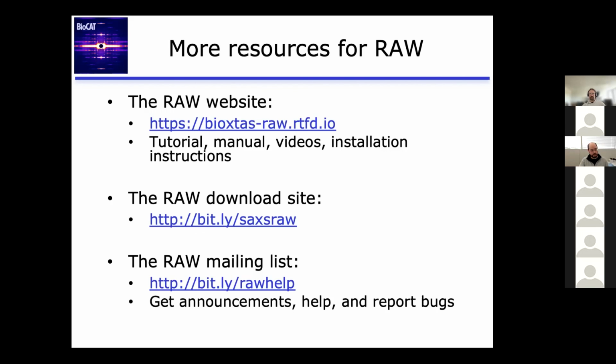There's one open source package for GROMACS, I think, where you can steer the MD based on the SAXS data itself, which is nice. But I don't think AlphaFold at this point takes anything as input. Certainly not SAXS data, not that I've heard. Yeah. Well, that's a question to ask them. So. Yeah. All right.